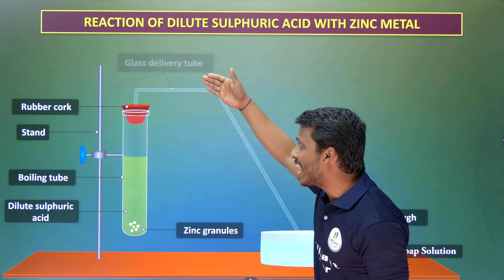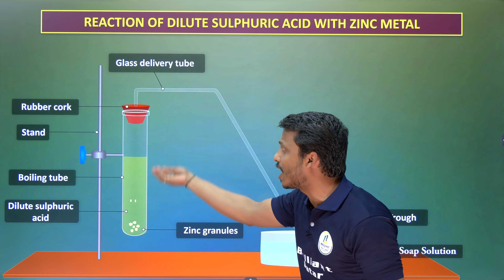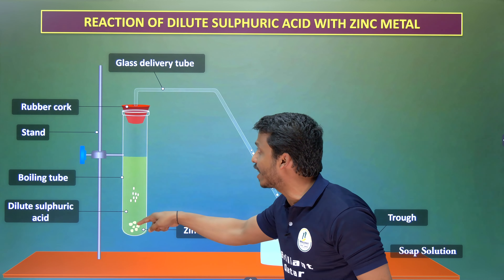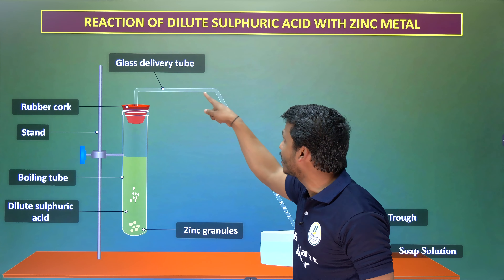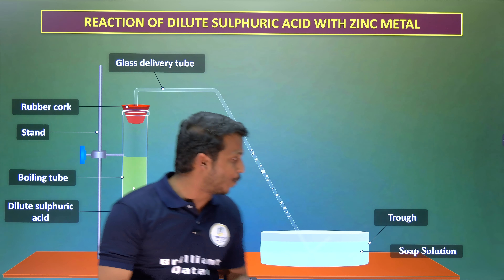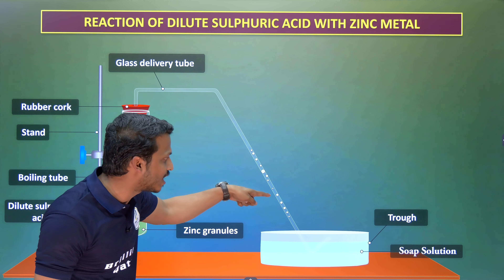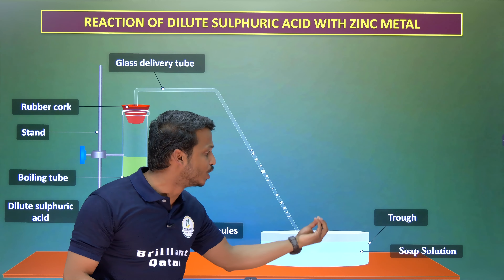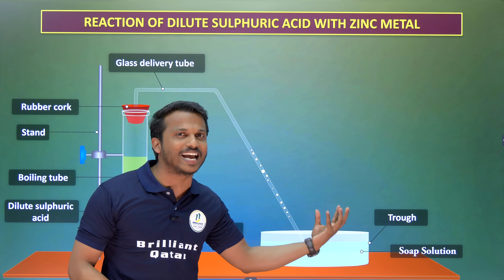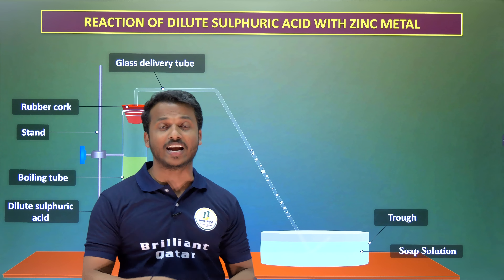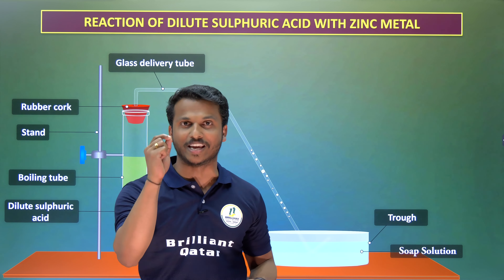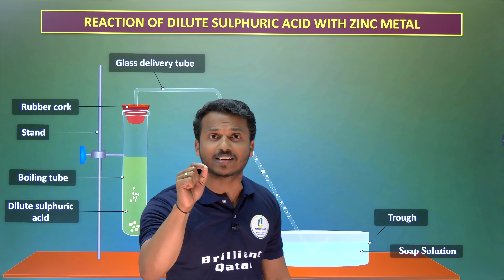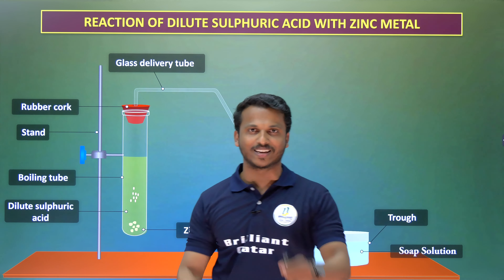You can see that some gases have started to generate. These gases are passing through the delivery tube. The hydrogen gas enters the soap solution, and some bubbles get generated. What gas do these bubbles contain? That is my question.